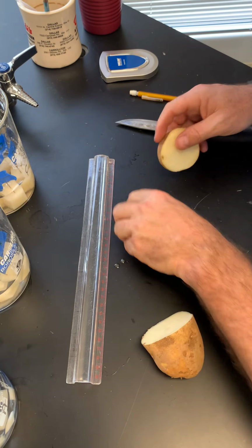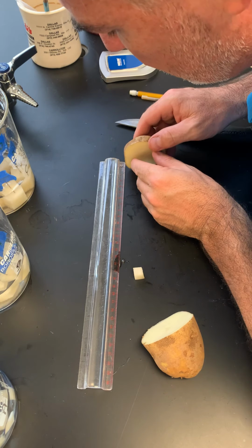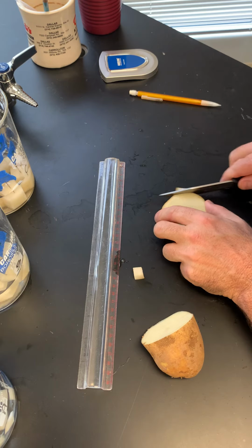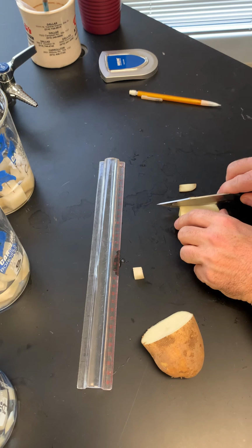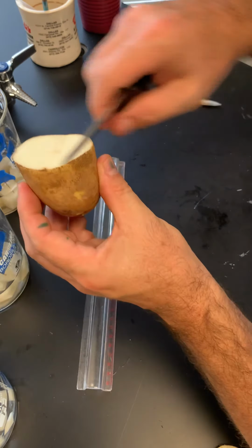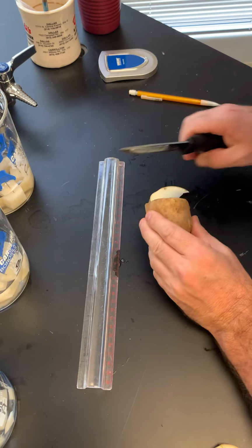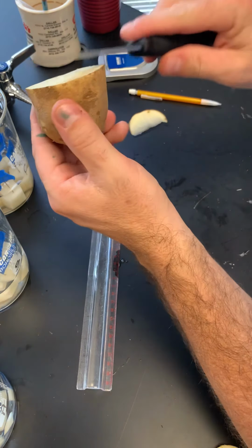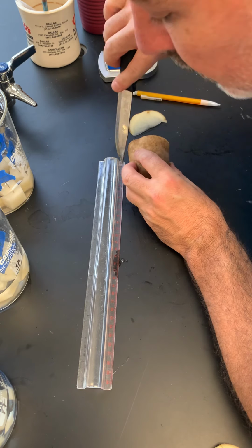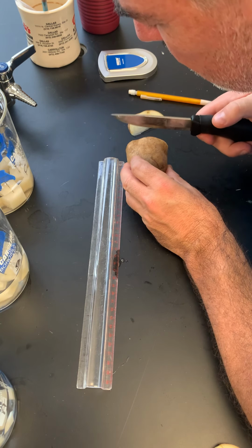It may take a little time. In fact, I'm going to start over on this one. Let me cut this potato. See how it's kind of slanted? Let me cut this potato straight down. There you go. Now it's not slanted, so it's not diagonal. I'm going to find one centimeter. And again, we're not going to use inches. We're going to use metric units.